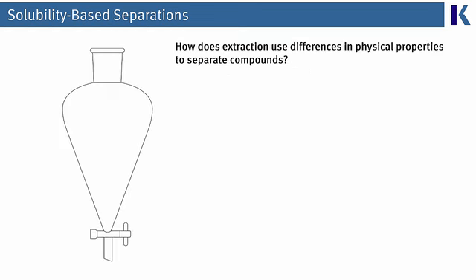But before we start the deduction process of which component is in which layer, let's first review how this separation procedure works. First, all separation processes exploit a physical property that is different enough between the components of the mixture. Extraction falls under the umbrella of separation processes, specifically isolating components from one another by transfer, where one component moves to a different phase than the other components.